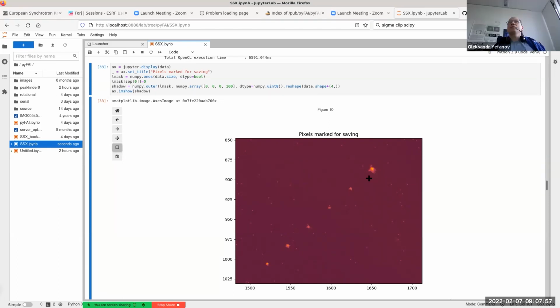But yeah, that's fine. What are the numbers at work? So what are the best numbers? What is the speed of processing per image? Less than 4 milliseconds. But then again, it doesn't help you. 4 milliseconds meaning 500 hertz, not 2 kilohertz. Yes, but we can have several engines like this in one computer, and we have several GPUs in one computer. Yes, I understood. Thanks, you explained it. So just more computing power.